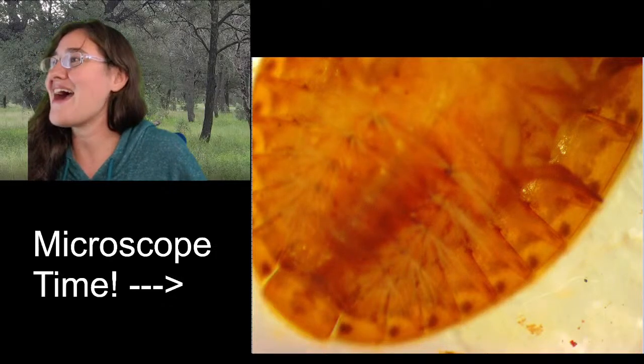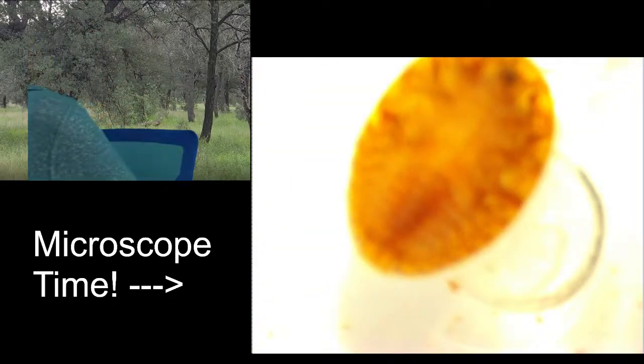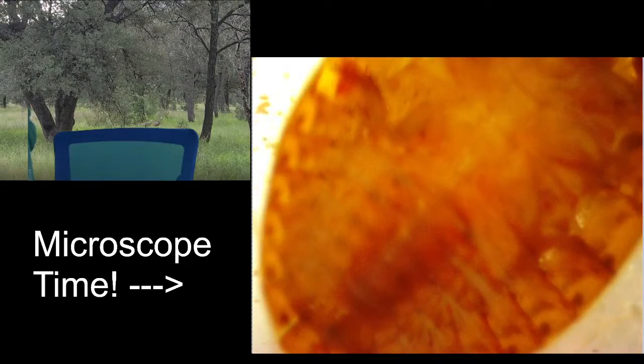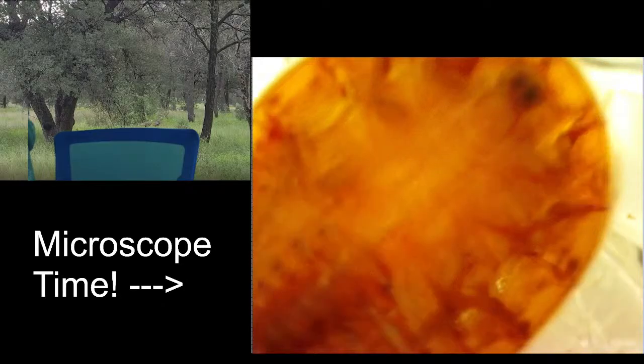They are bushy gills. Alright, and I believe there may have been one or two of these guys that was actually so big that I thought that they might have babies, but I don't see anything here. He looks so cute. Yeah, so that's that.